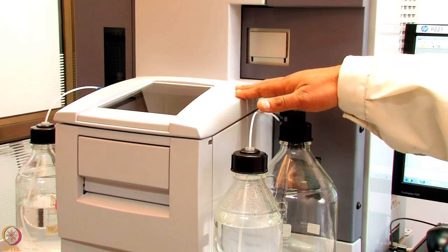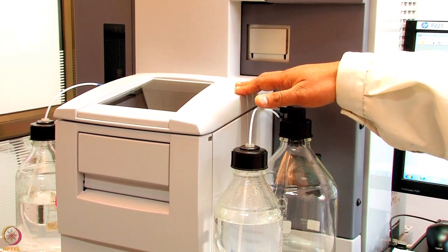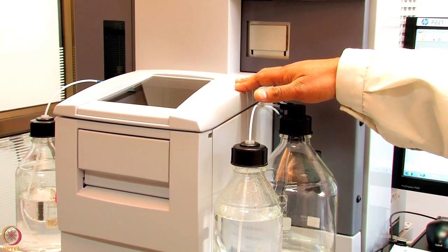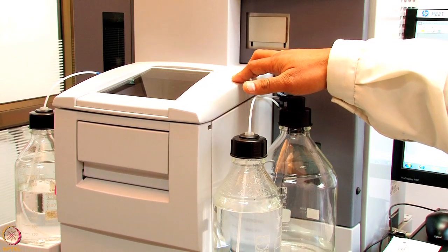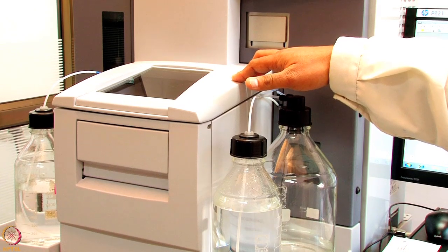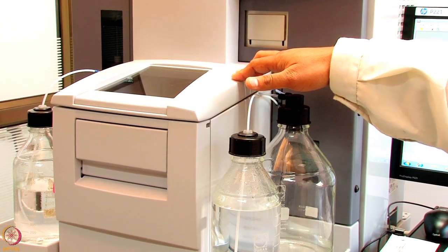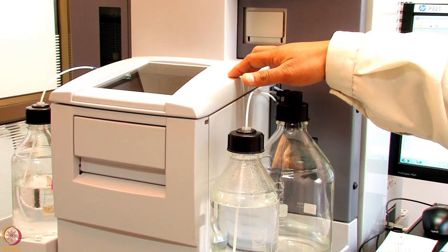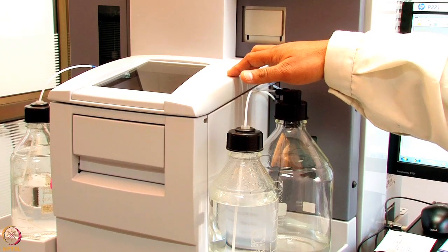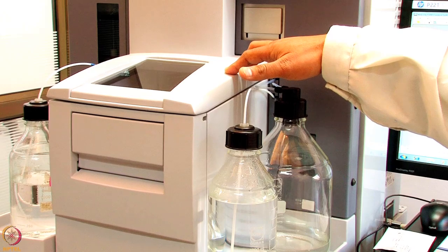Generally, in any Biacore experiments, buffer should be connected and equilibrated overnight. Or if there is no time, a minimum of 3 hours of equilibration is essential. Otherwise, when starting a new experiment, do at least 6 primes on the system.